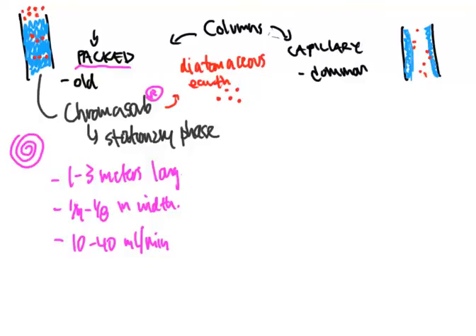Diatomaceous earth is very light and it's very fluffy. So if you are working with it in the lab, and we have some, if you take the lid off of the jar, it's a very light powder, almost kind of like flour in a way. If you slap flour onto the counter, you see it go poof. And the same thing happens with diatomaceous earth. So these things are like little sponges, and there's openings and craters in them, and your sample goes through all of those little openings and crevices slowly, little by little, as it travels throughout the column.